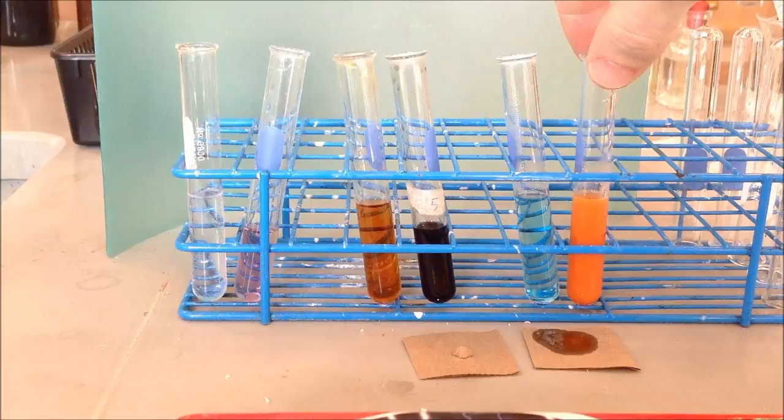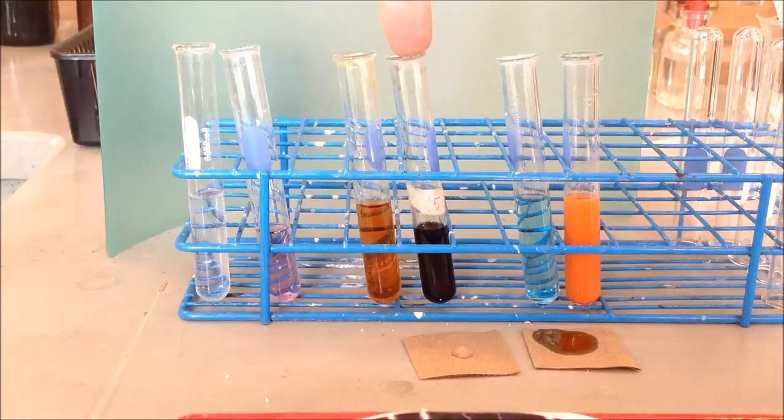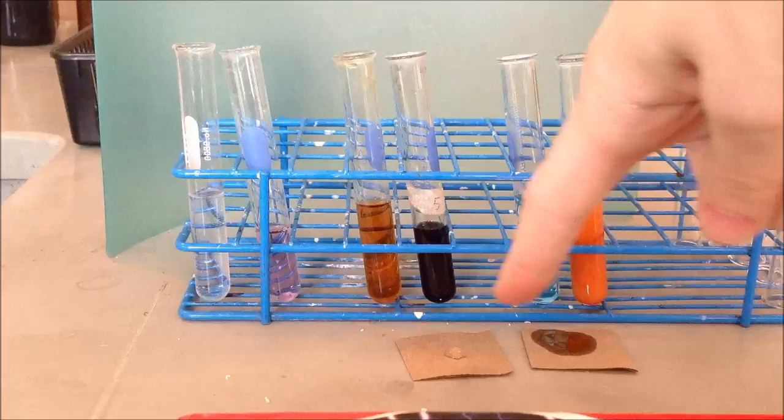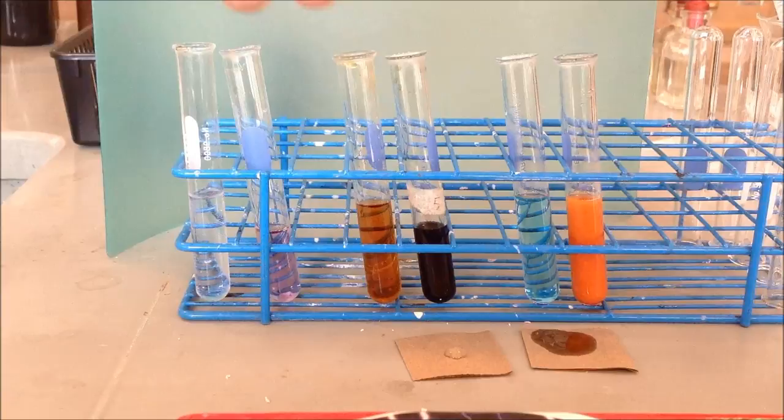We have all of our tests done. We have our negative and positive for protein, our negative and positive for starch, our negative and positive for glucose, and our negative and positive for lipids on the brown piece of paper. We'll be using these as reference for later on when you test the food items to see if they have proteins, starches, glucose, or lipids, comparing how they look to your positive and negatives from the control experiments. Feel free to go back to the previous parts of the video where they show the results of the control tests.